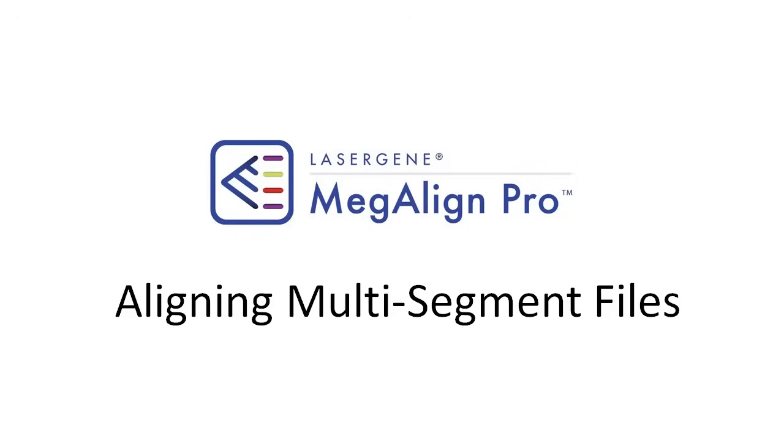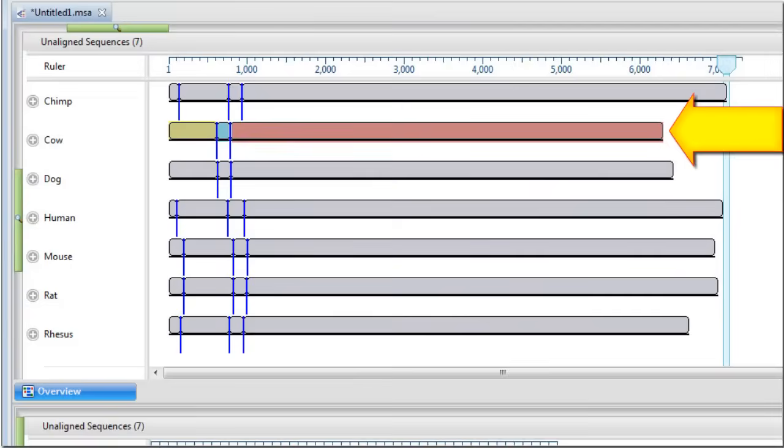Sequences that consist of more than one chromosome, contig, or fragment are called multi-segment files.